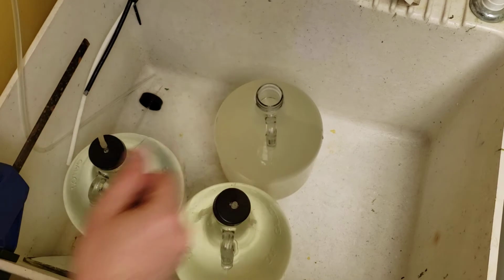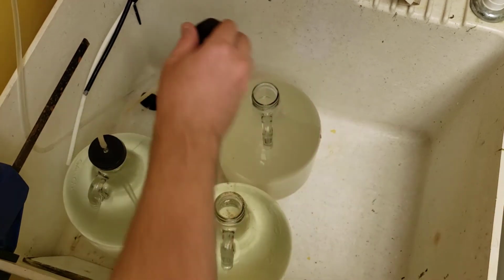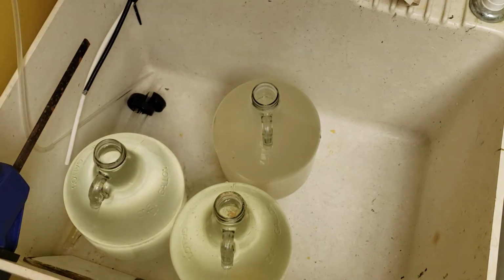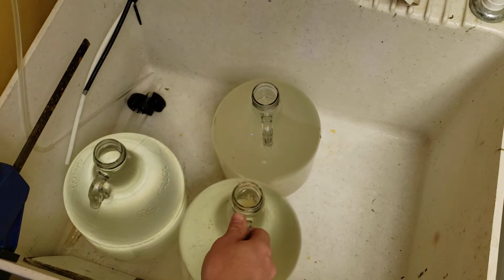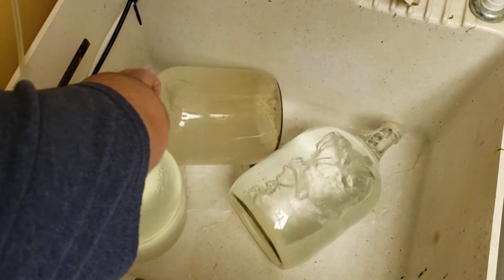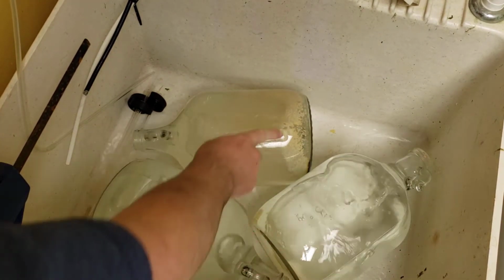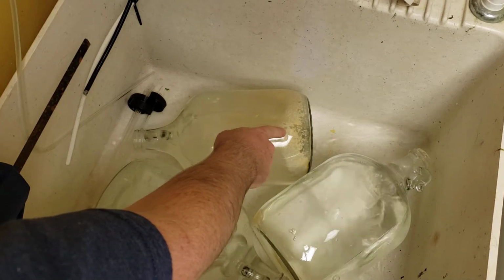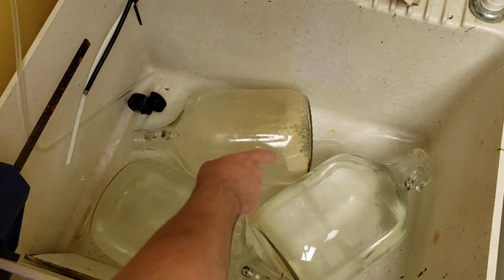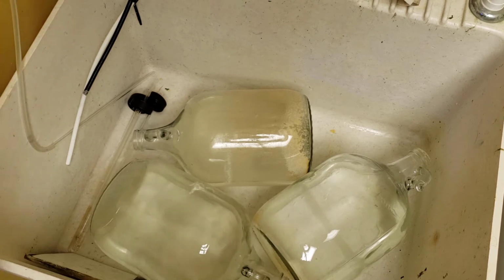So I'm going to show you that these have all been soaking for 24 hours in a bleach solution. This is going to dissolve away any organic buildup. Go ahead and start draining these. So all that's left is going to be just a residual bio or mostly a calcium buildup, but also some algae as well.